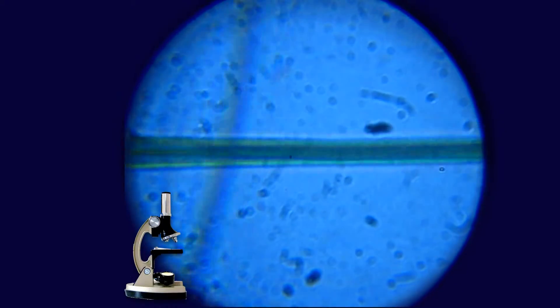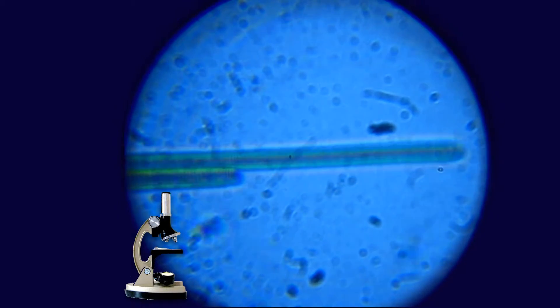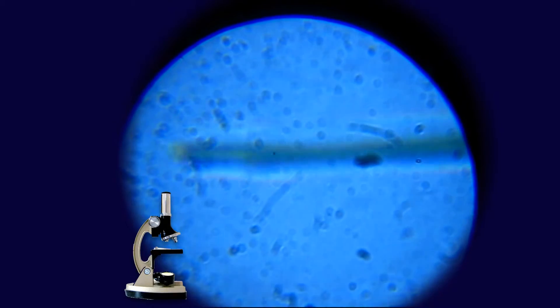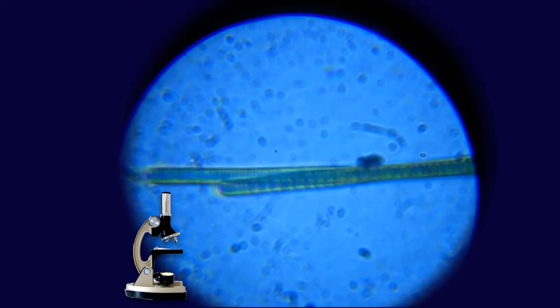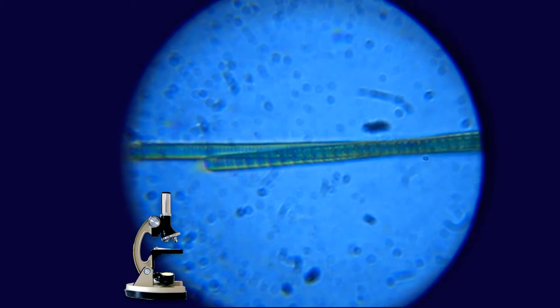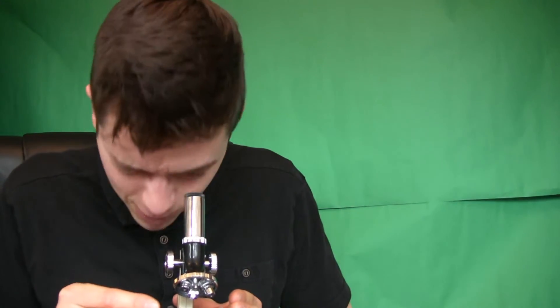Now here's something that looks interesting. It looks like cyanobacterium filaments, so they're bacteria, but they work a bit like plants because they take energy from the sun to make their food. And they're green like plants as well. You can see a nice green strand, and if I focus properly, you can see that it's made up of lots of, looks like lots of little slices. And each one of those slices is a single cell. So there are lots of bacterial cells. They work together as a filament to get as much energy as possible.